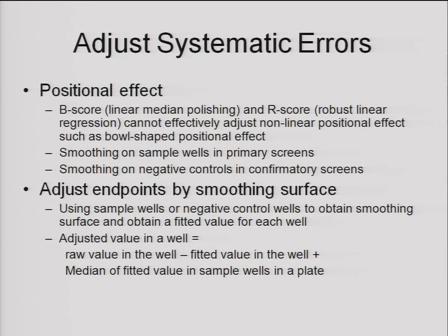And so the best strategy is, for a bowl-shaped effect, you can use smoothing.